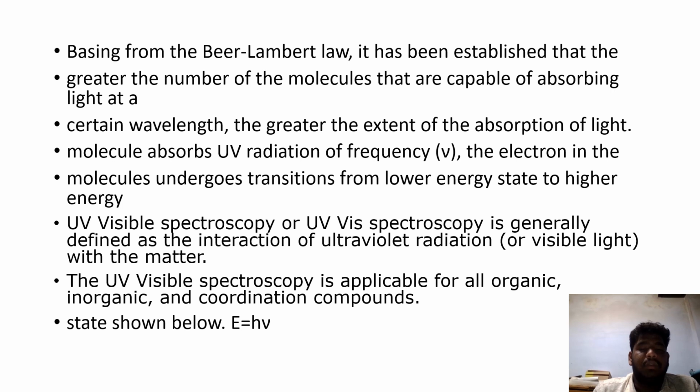UV visible spectroscopy is generally defined as the interaction of ultraviolet radiation with matter. UV visible spectroscopy is applicable to all organic, inorganic, and coordination compounds. The energy is shown below: E equals hν.